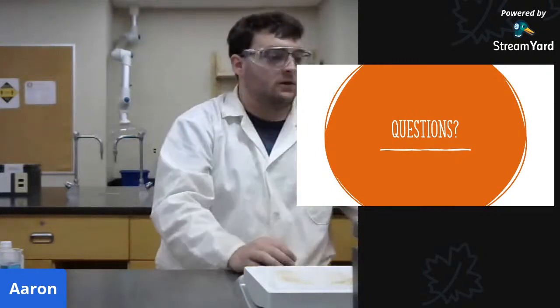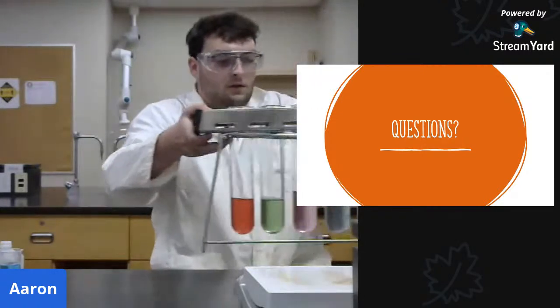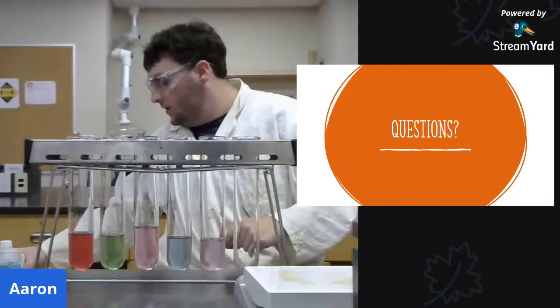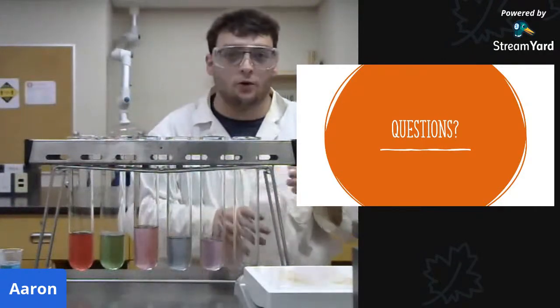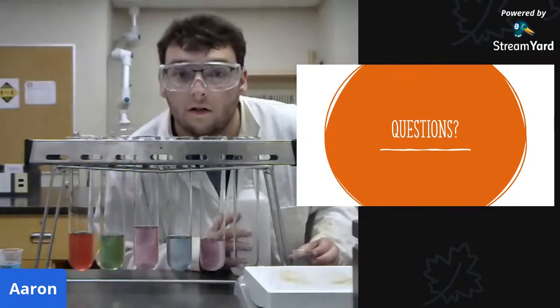Any more questions? While we're waiting for some more questions, I'll throw some more chemicals in there, in our little rainbow assortment here. So with me here, I have isopropyl alcohol, pretty important nowadays for cleaning, used as a disinfectant.